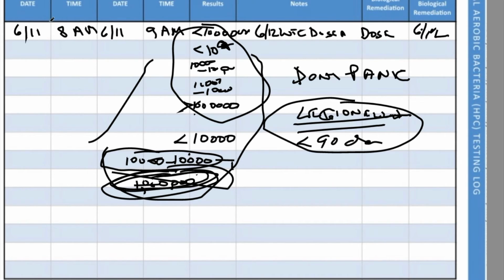Well, since you're testing weekly anyway, you're almost automatically satisfying that requirement. So next week, you would be doing this again, and the week after that, you would be doing this again. Right? So each week you'd be taking a sample and adding to this list of the results of your bacteriological samples.